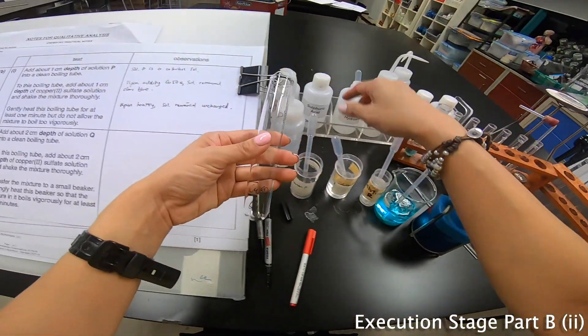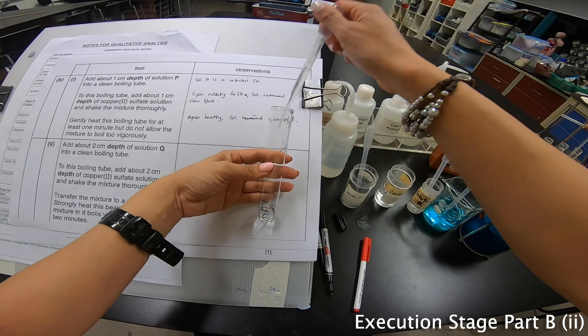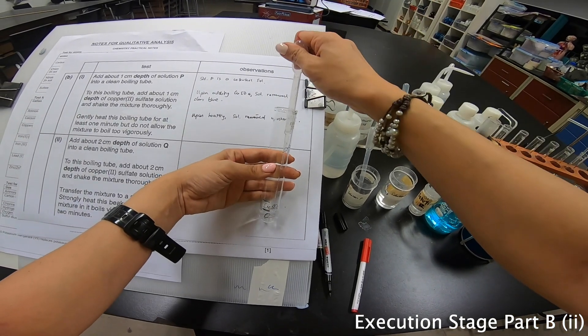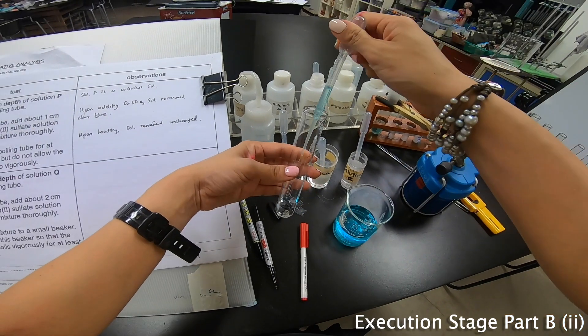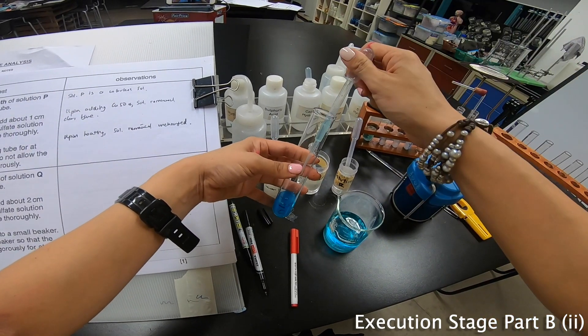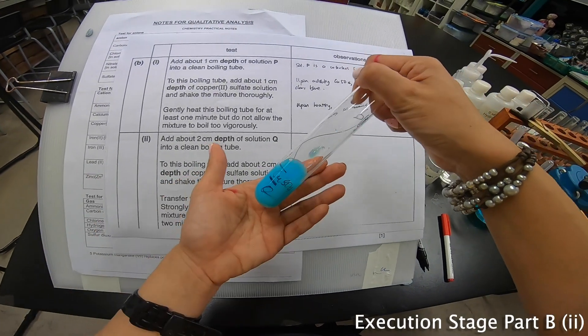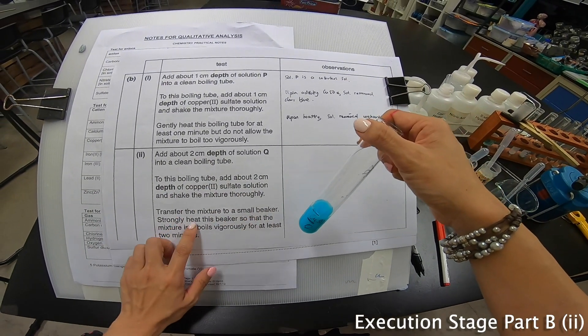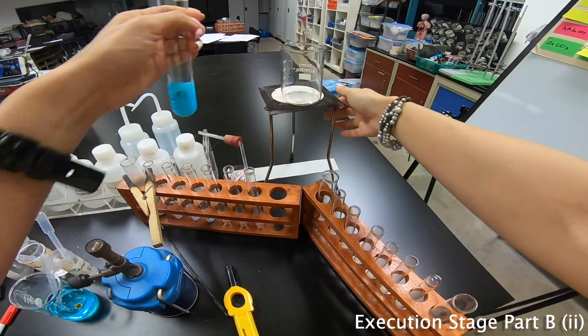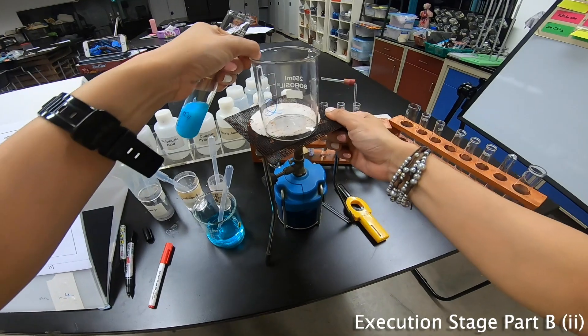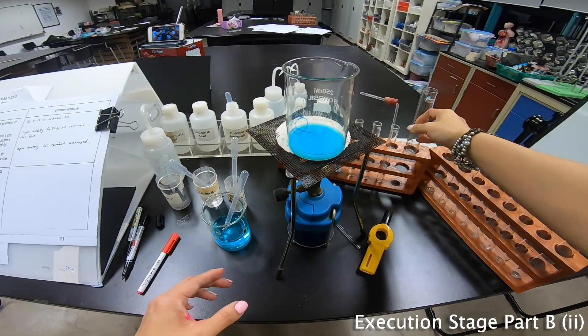Now this portion here is Q. So I'm going to add Q. Followed by my copper sulfate. Wow, very nice color for me. It's a blue precipitate. Now they say shake the mixture thoroughly, transfer this mixture to a small beaker, and strongly heat this beaker so that the mixture in it boils vigorously. So I have the beaker over here. I'm going to transfer it right over in front here.